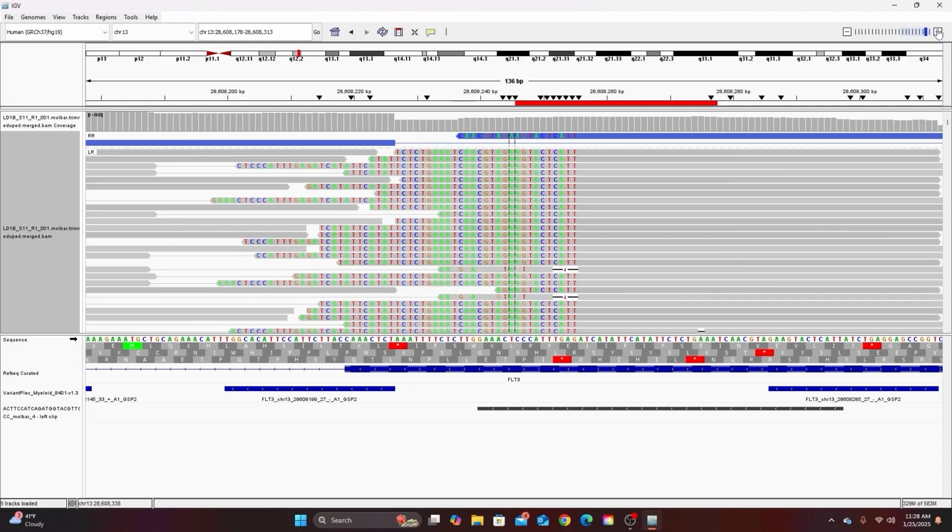So if I zoom in, that makes it a little bit easier to double check. So again, this is the sequence that I blatted. So it starts with a TTAC. So if I go to where it says that it belongs, TTAC, right? And so if I look carefully, I can see that this misaligned portion actually aligns here. It's just this portion repeated. So this shows you that there is an internal tandem duplication. And this internal tandem duplication is very short. It happens within the span of a single read.